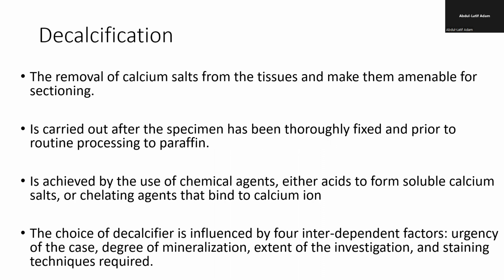So how do you decalcify? As I've mentioned to you, you decalcify to remove calcium salt from the tissue and make it soft enough for penetration of fluid and also for sectioning. Okay, because you're going to produce thin sections for staining and microscopy, and you can only do that when there is no calcium.